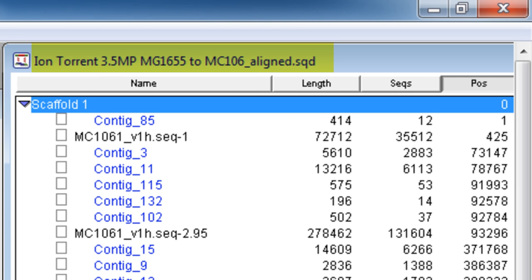To learn more about the various files generated by reference-guided bacterial assembly with gap closure, please visit our automated bacterial genome closure video.